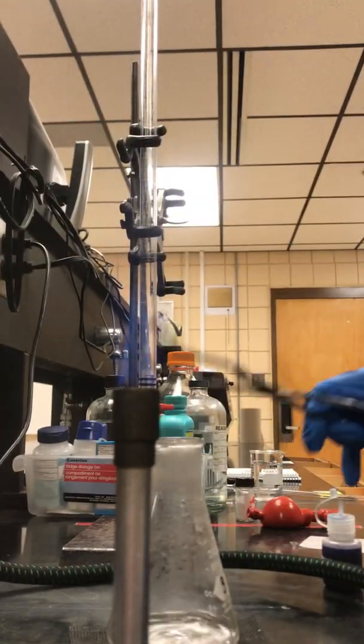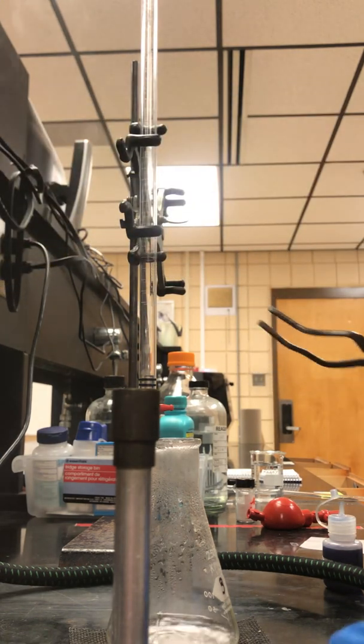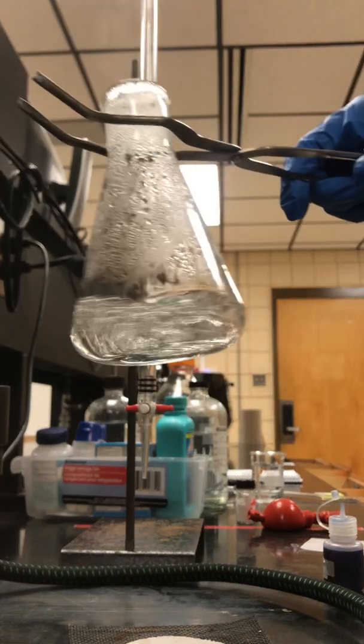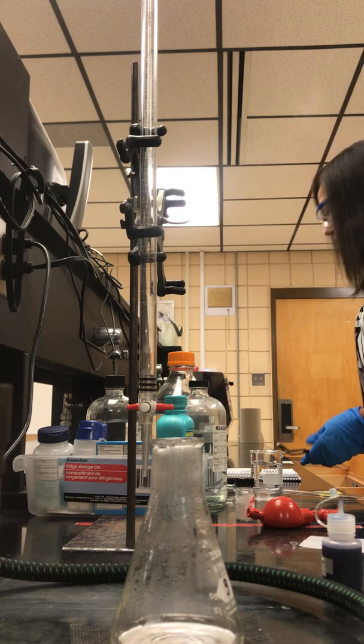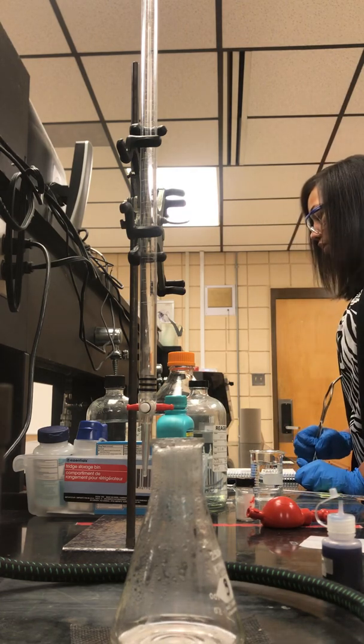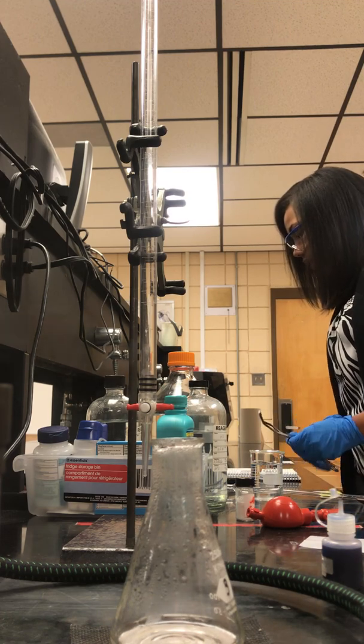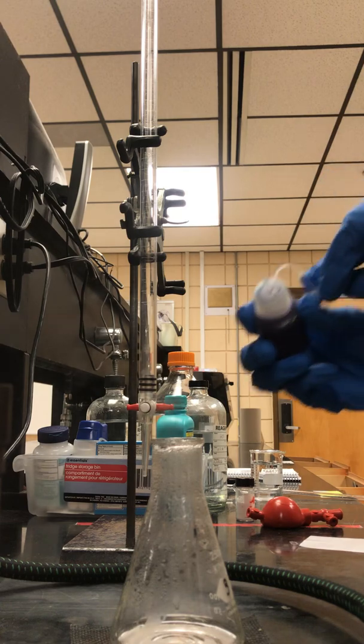Once you're finished with the Bunsen burner, turn it off and move it out of your way. You notice we have our gentle boil. After we've heated for that one minute to remove the dissolved carbon dioxide, keep gently swirling.